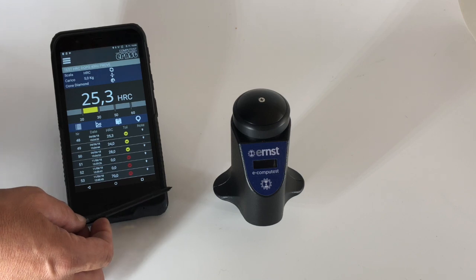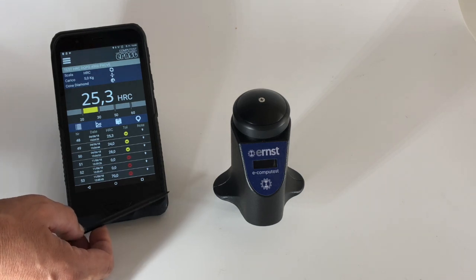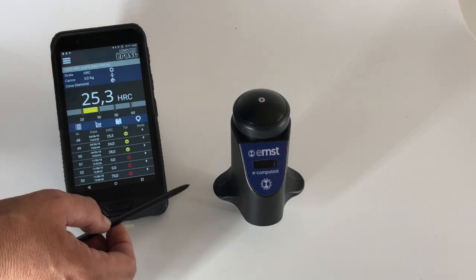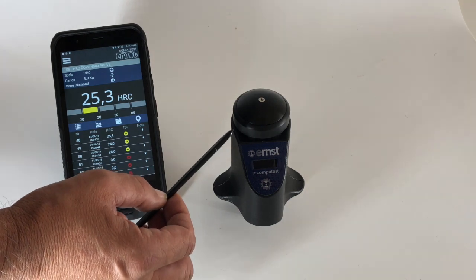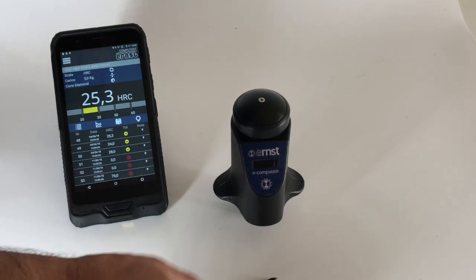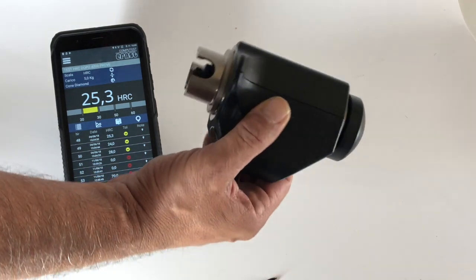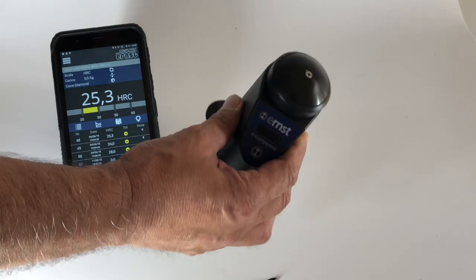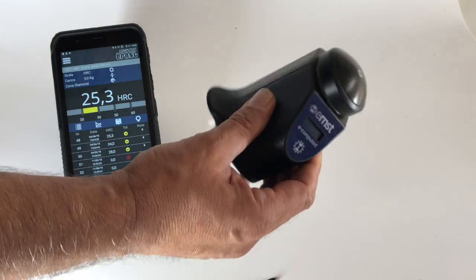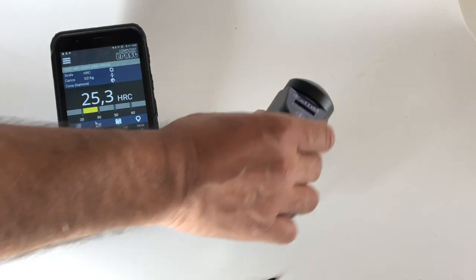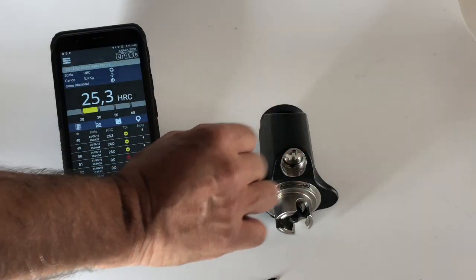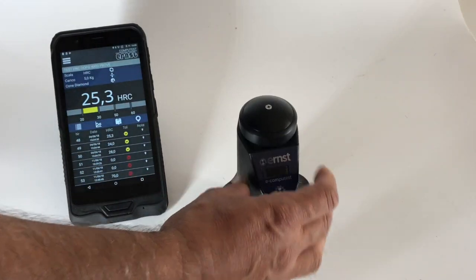Okay, as you can see, this unit has no cable, and also it can be recharged wirelessly using a special base for recharge.